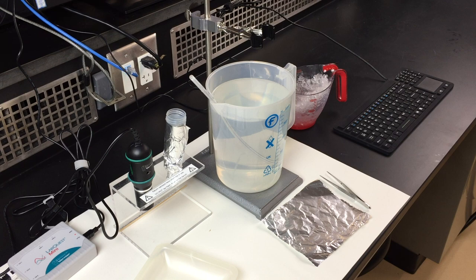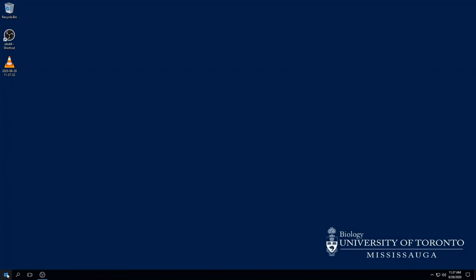When you have the water bath ready, you are ready to calibrate your oxygen sensor for the first recording. The software we need for this experiment is Logger Pro 3.15. You can find that under the start menu, course application, Logger Pro 3.15.